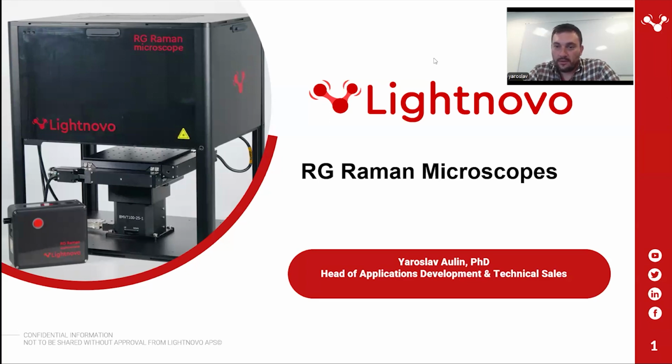Any other questions? Yes, there is another question. This is not a question for the microscope. Can we install a probe to the RG Raman spectrometer to see real time monitoring and see chemical reactions? Yes. I think monitoring of chemical reactions is one of the potential applications here. If you talk about the probe, we have probes with different working distances because it's just a free space spectrometer. But if you are asking about a fiber probe, then it's not available yet.